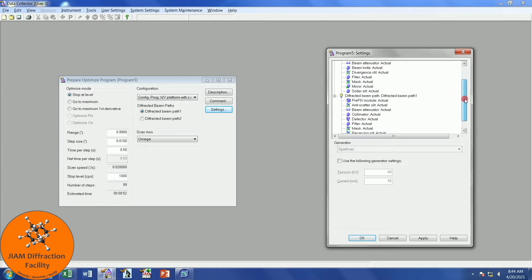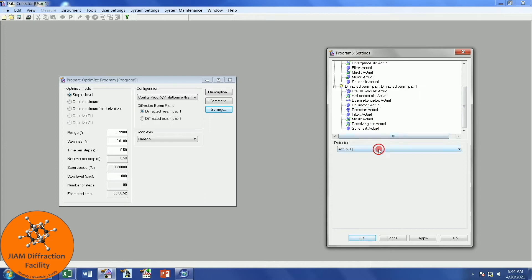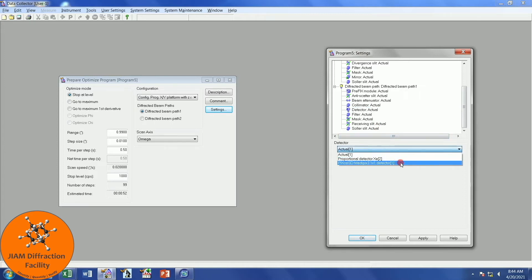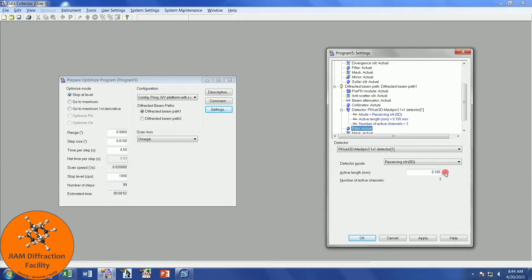For now, though, at the very least, if you don't set up anything else, I do recommend that you come down here to detector and choose which one you will use. Personally, I am using the pixel detector, so I will choose that. I want to make sure that it is receiving slit 0D. I will change my active length to 0.1 and hit tab on the keyboard. We see that it changed the active length slightly and gave me three active channels. Now I will click OK.